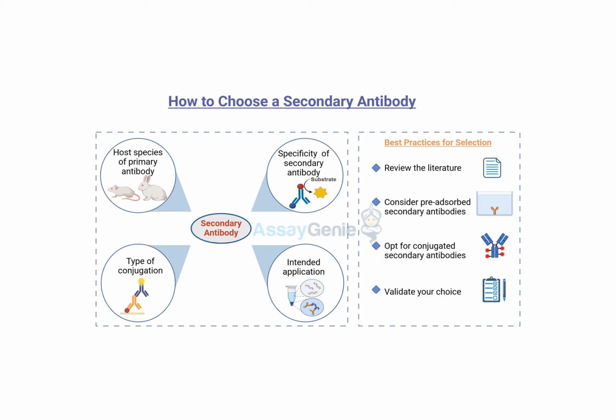For sure, there's a growing movement now towards developing methods that don't use animals at all. Yeah, I've heard a little bit about that. What are some of the approaches that people are trying? So one that's really promising is called phage display. Instead of using an animal, you basically create this library of antibodies in the lab.